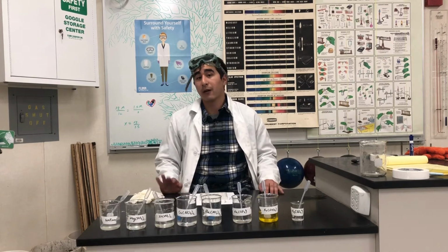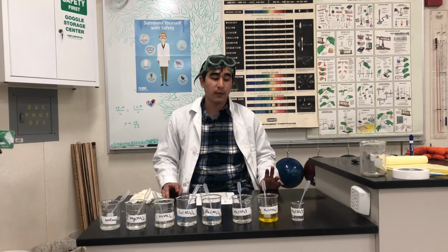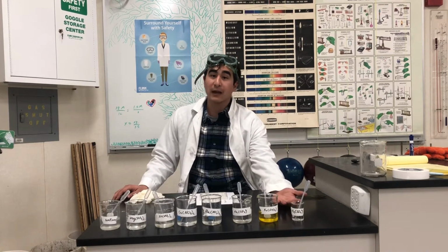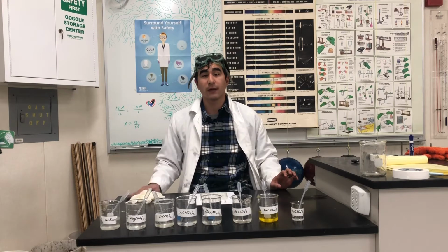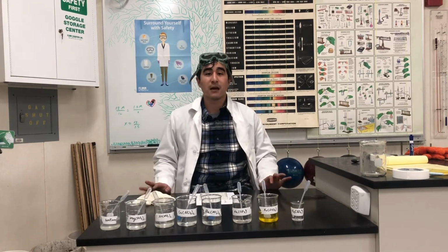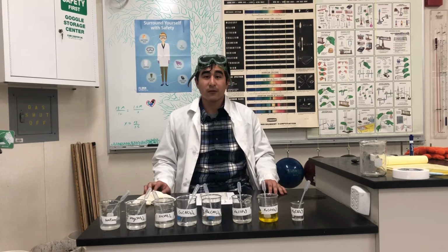And lastly, before I begin, I just want to make sure that I'm pointing out all of the safety features, because I'm working with sulfuric acid, which is highly corrosive, and so I want to make sure that I have my goggles, my lab jacket, and my gloves on throughout this time. All right, so without further ado, let's get started.